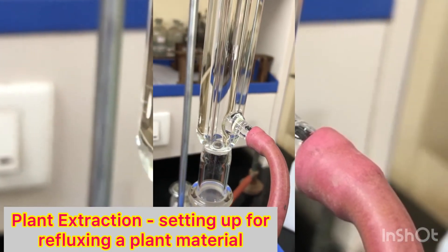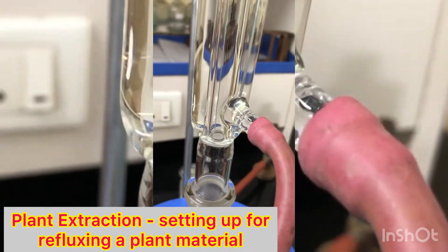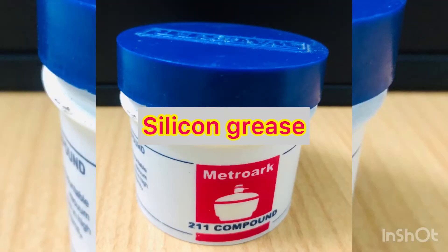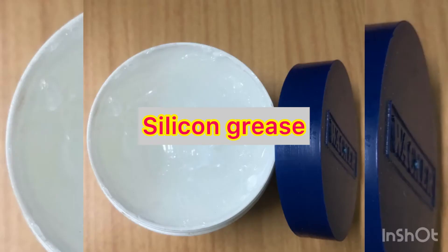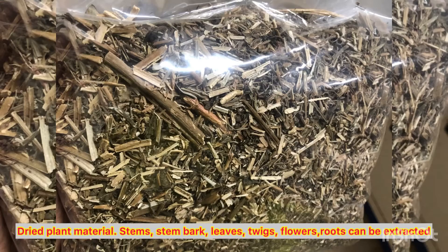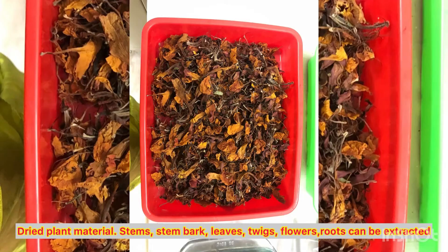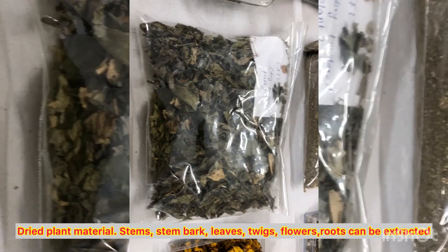This is a picture of the silicon grease which is available in the market — you can apply it to the ground glass joints of the condenser. These are pictures of dried plant material, thoroughly dried. Under indigenous conditions in India, we can just dry in the air; we need not use an oven, and you must not dry in the sun. This is important.